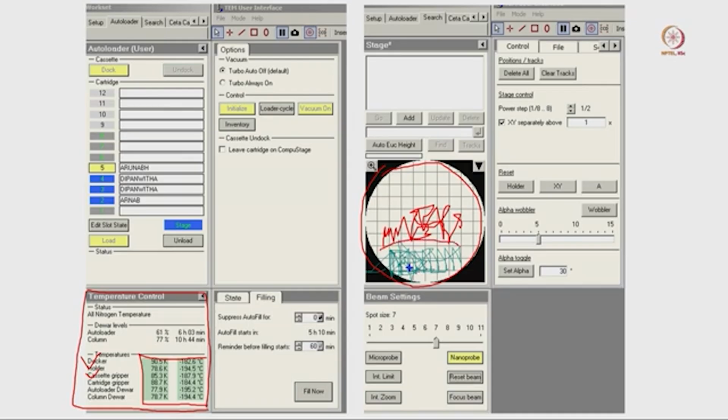Here I am showing you one of those trajectories, where you can see in a very smooth way the initial pattern, it is going like this. So, it is following some kind of pattern, and initially we are making our atlas and checking the entire grid. When this is done, we are just moving around randomly to select some area.